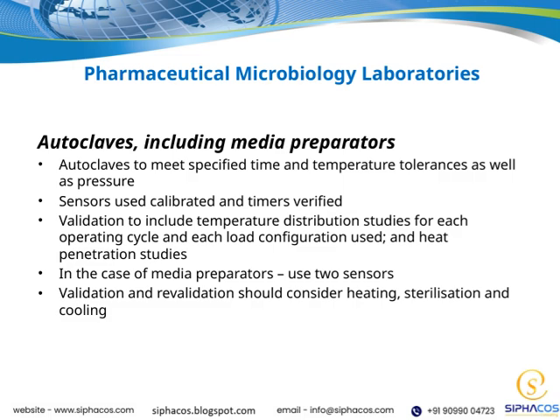When it comes to media preparators, we typically use two sensors to get a more accurate picture of the sterilization process. Remember, validation isn't a one-time task. Revalidation should consider all phases, heating, sterilization, and cooling, to maintain confidence in the process over time. This whole approach is vital for our pharmaceutical microbiology laboratories. It ensures our sterilization processes are robust, consistent, and compliant with regulatory standards, ultimately safeguarding product quality and patient safety.